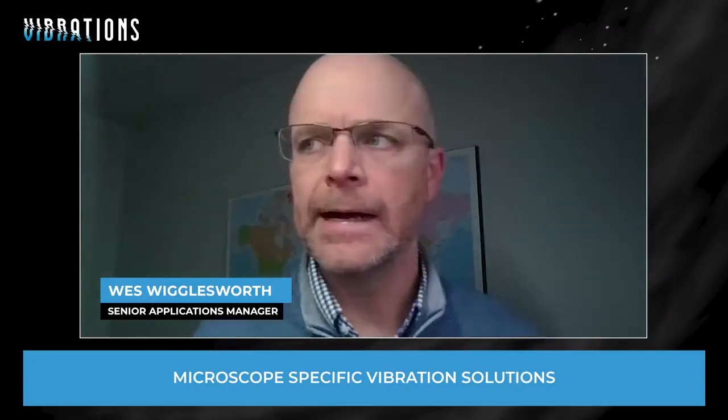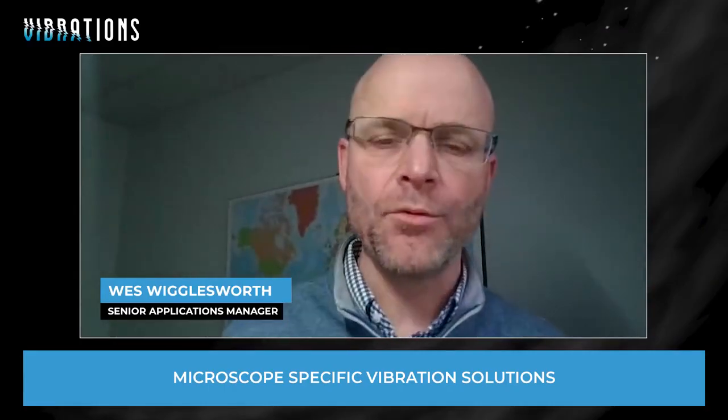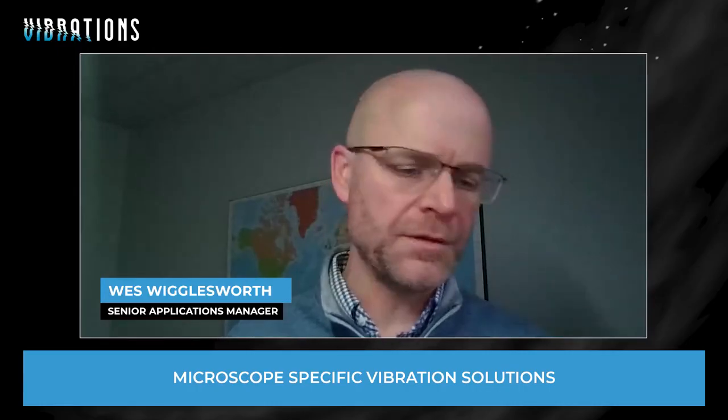It's not just a snapshot. It's not just one measurement. And it's not one set of parameters for that measurement that fits all. It's understanding all these different important aspects of the microscope, the facility, and the measurement that all comes into play.